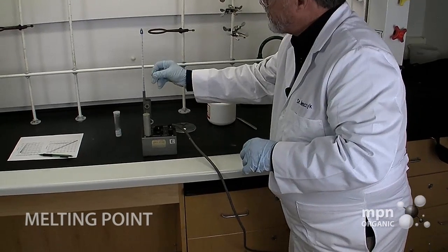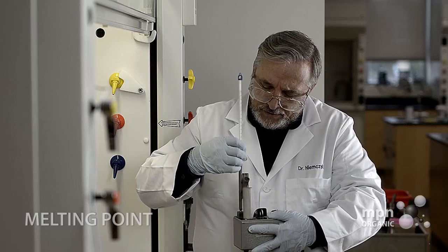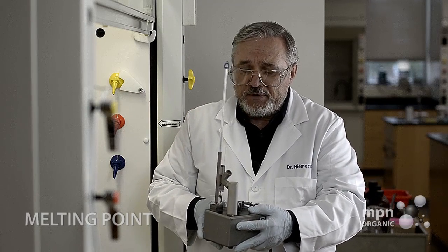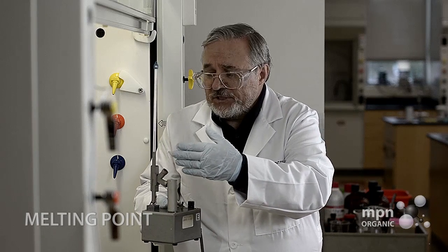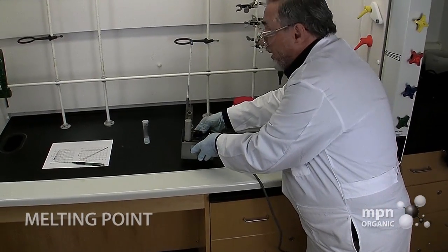And now, we're going to put the sample in this sample holder right here. And Mel-Temp has provided 3 such positions in this sample holder, which means that you can take up to 3 melting points at one time.